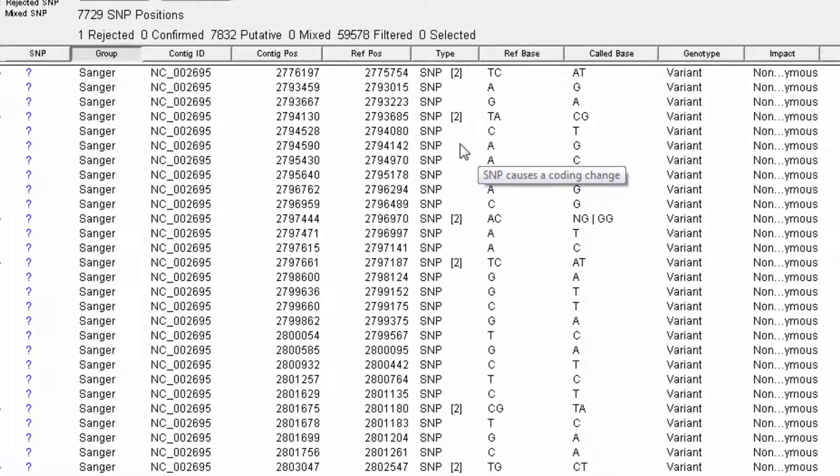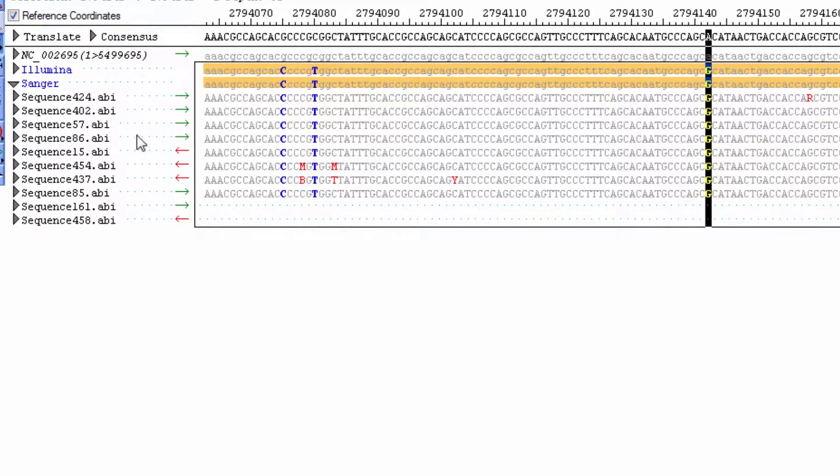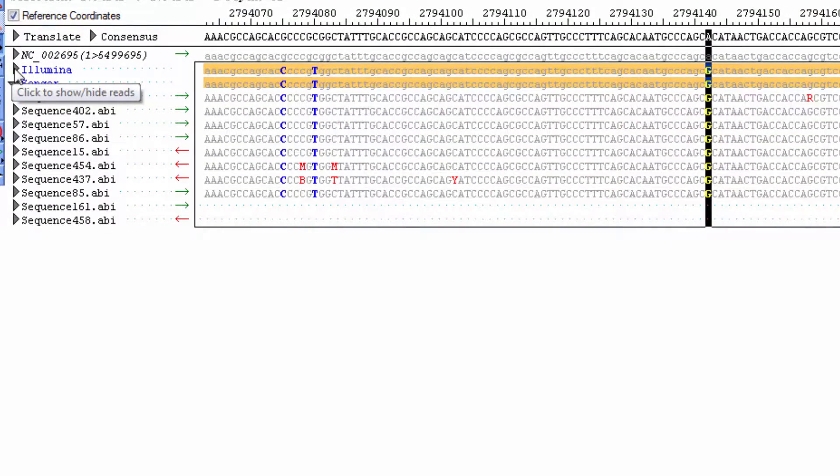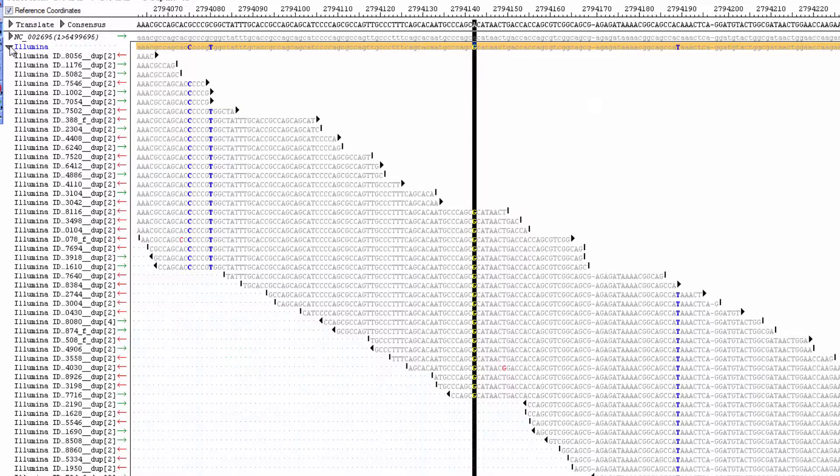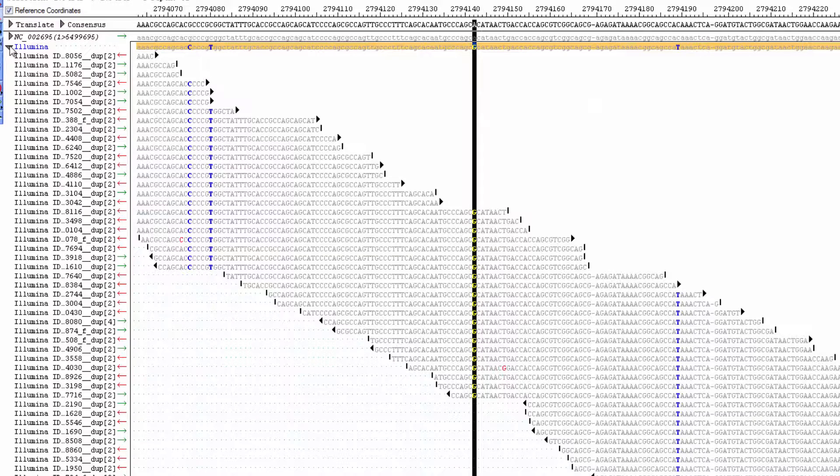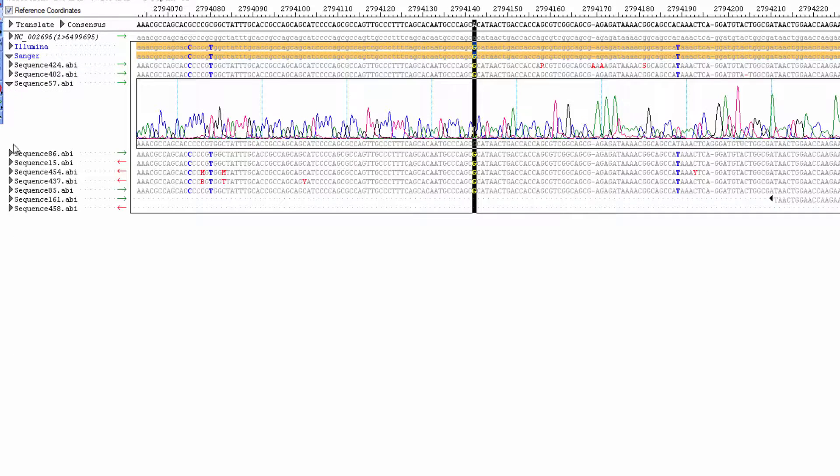From here, you can double-click a SNP row to open that position in the alignment view. Then, examine the next-gen read alignment, as well as the Sanger alignment and trace data.